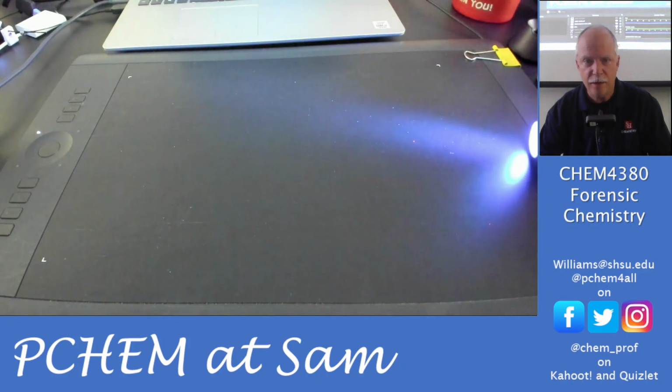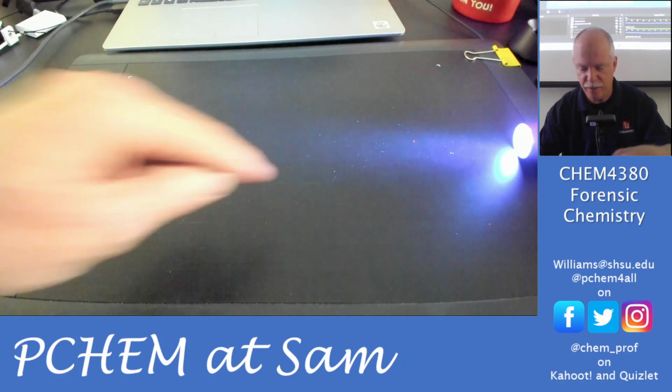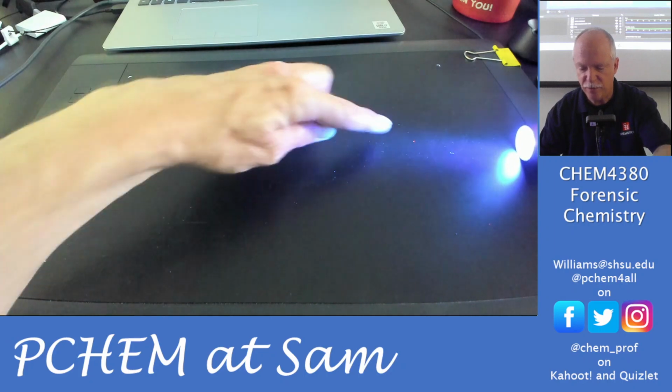Yeah, okay. So you see how the light is just grazing along the surface and the dust really stands out. You can see dust particles here, right there. Let's see, right there. And then there's a fluorescent particle here.